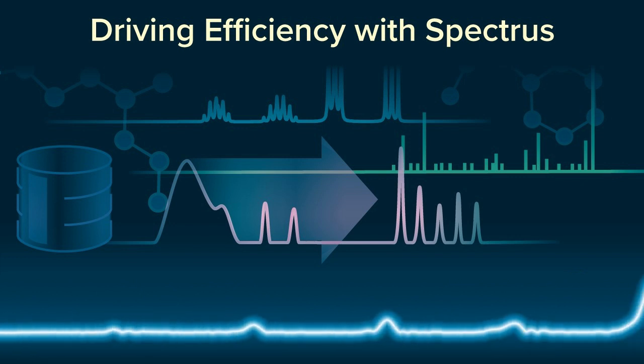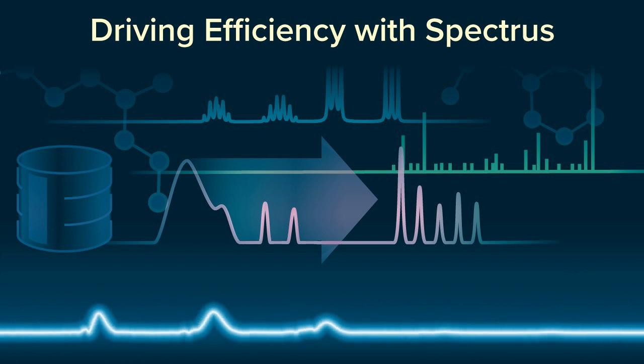If you have a good fit between the two, then you get a positive interpretation and a positive match of your sample with the selected DRM. If not, then you receive an answer that this might not be a good match or is even a complete zero match. By reducing the need for physical reference material, that would make these structure verification workflows more environmentally sustainable as well.